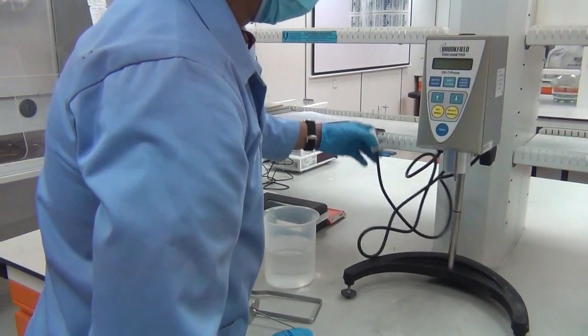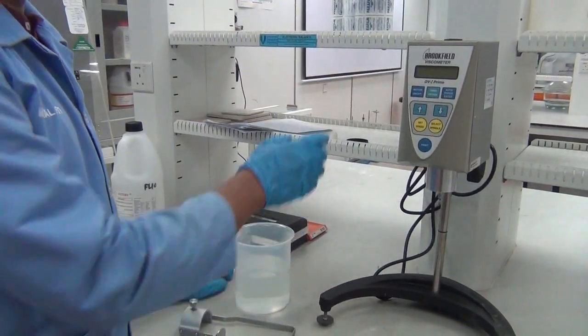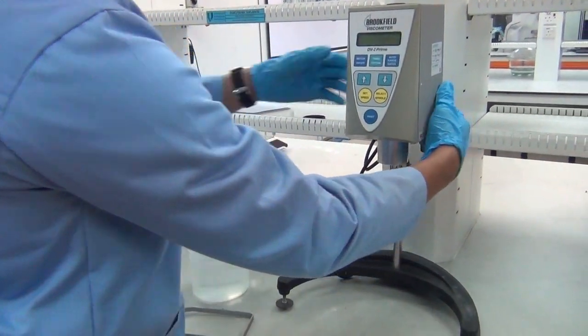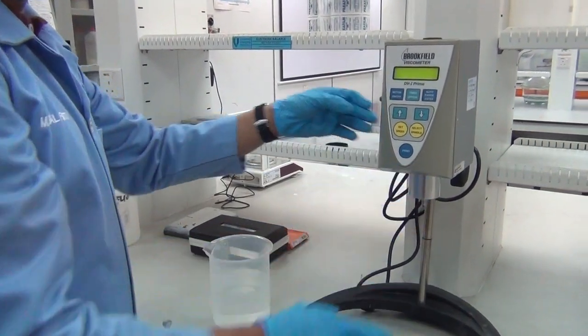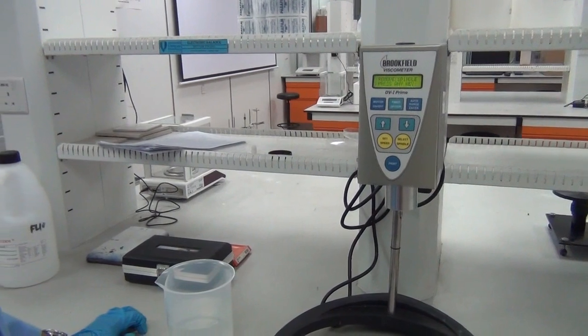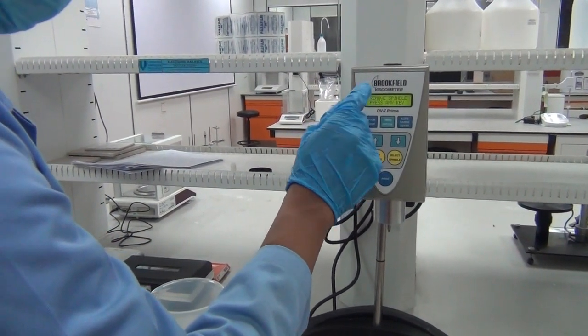Then we switch on this viscometer. Plug in the viscometer, then switch on the instrument at the back. Wait for a while, then it comes up with 'remove spindle' and press any key.